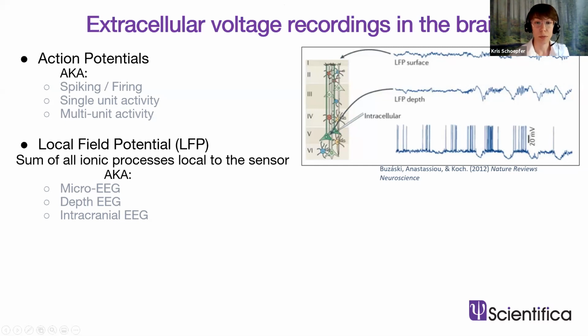And so one is able to measure the local field potential at various points in the brain. For example, here's a nice image from a review several years ago from the Buzsáki group, demonstrating that, yes, we have the action potentials. You could record those intracellularly, and you see these same patterns mimicked in the local field potentials.